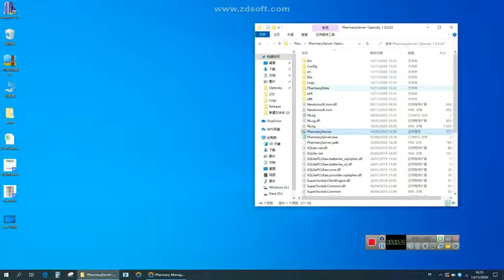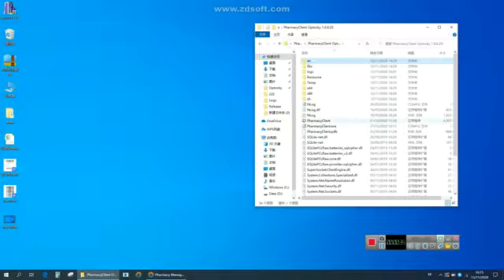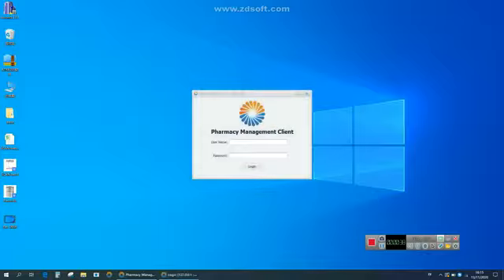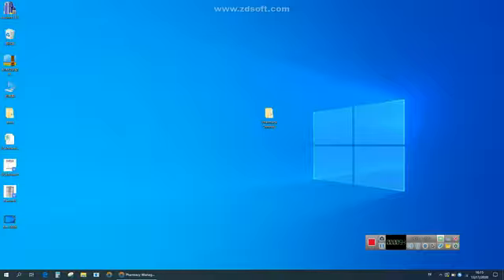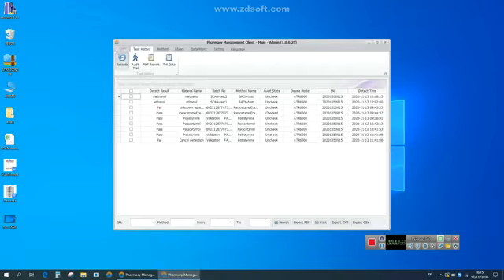And here you can click data management archive. You can archive by filling in the serial number, from the day you want to archive till the end day, and click archive. You can archive all the database.